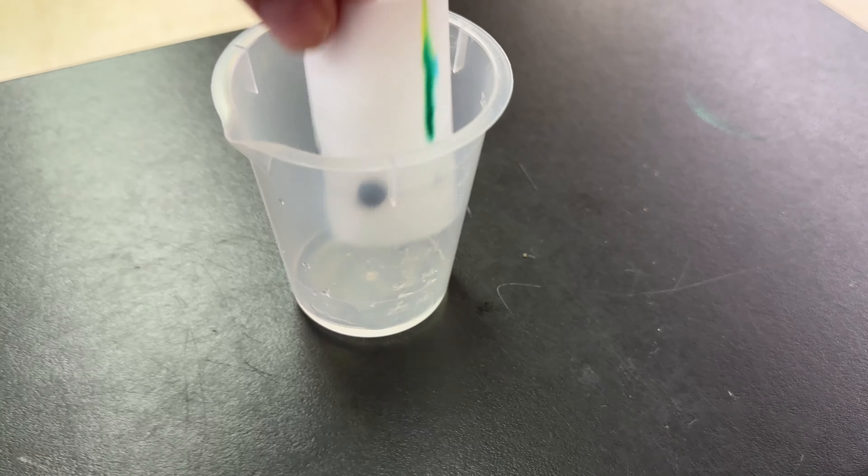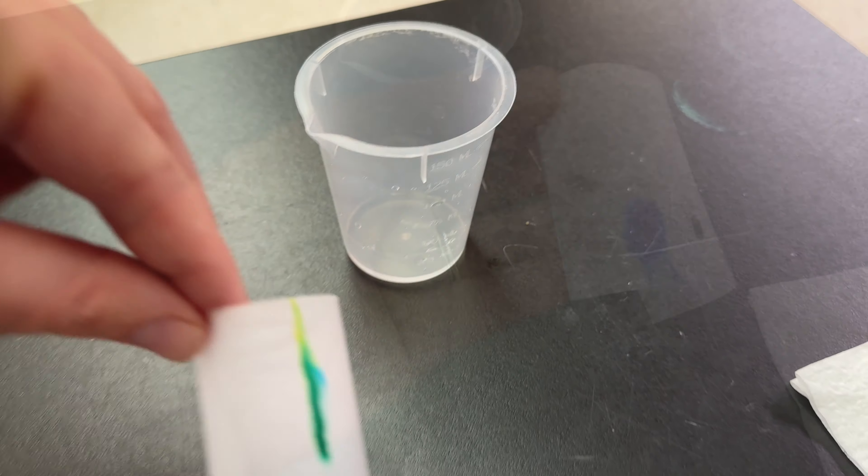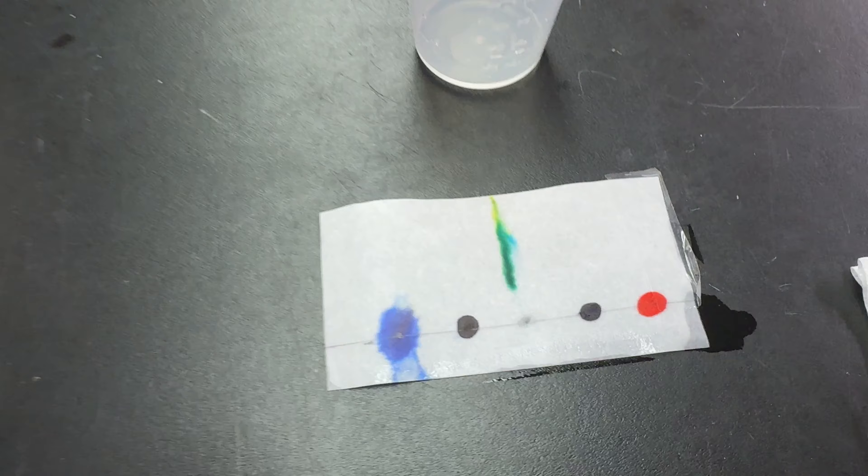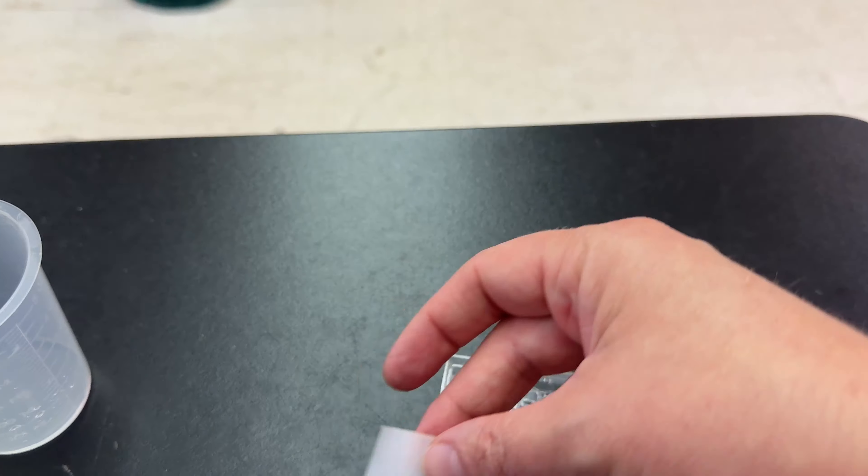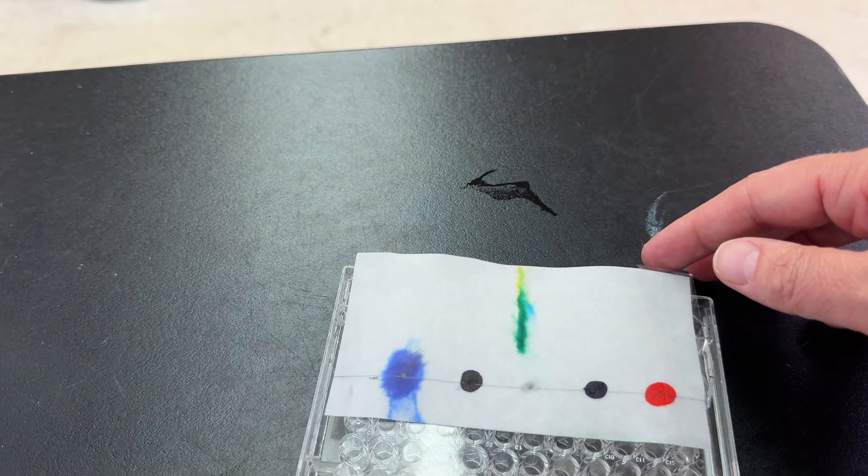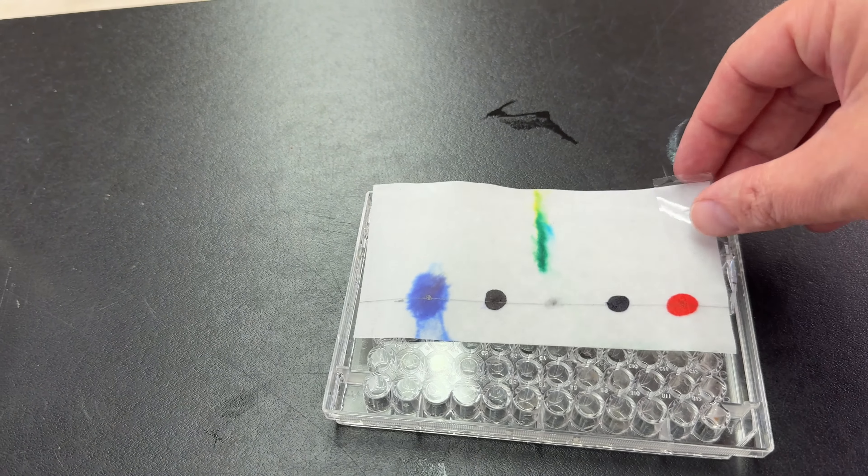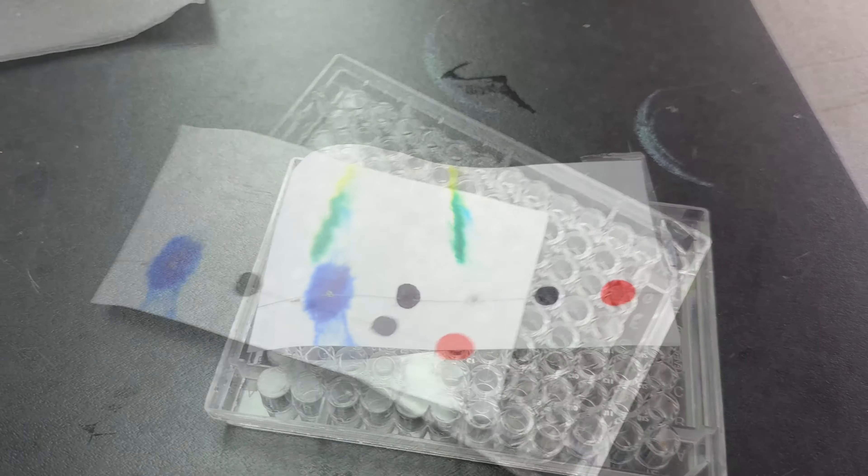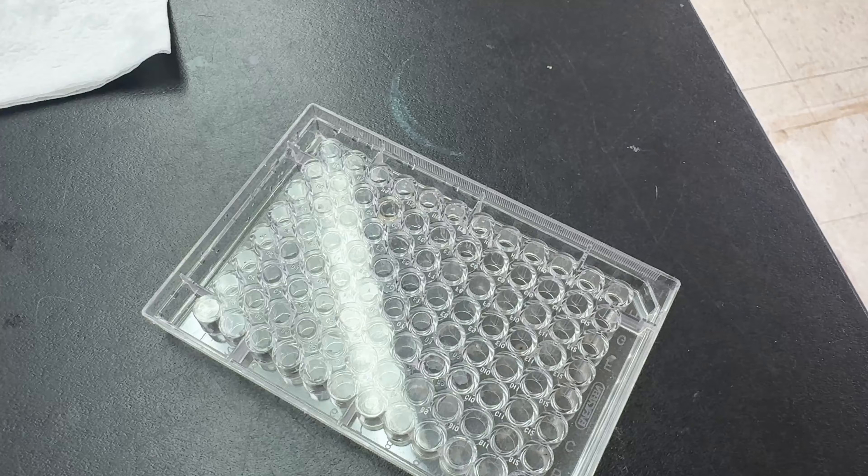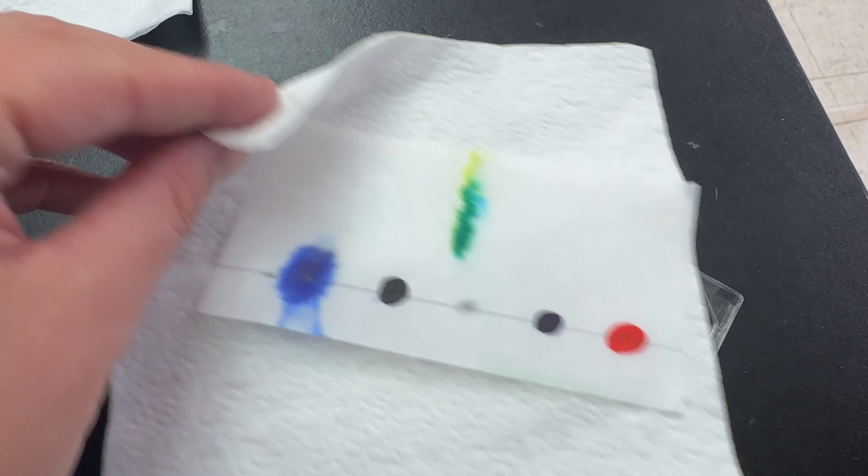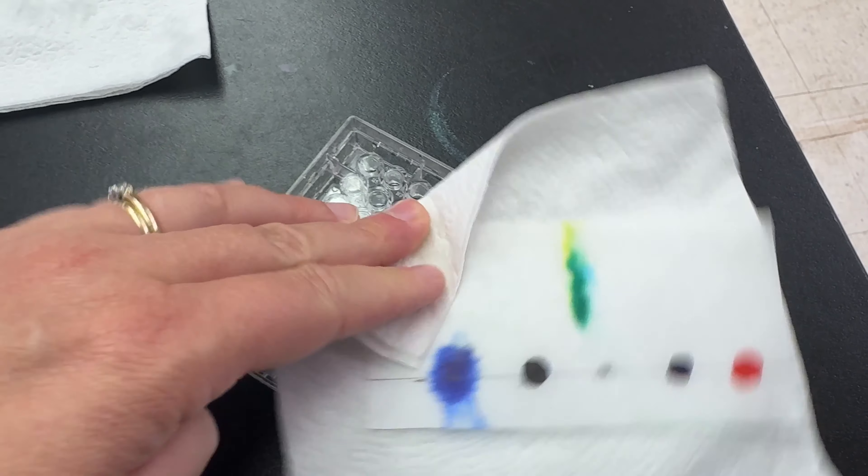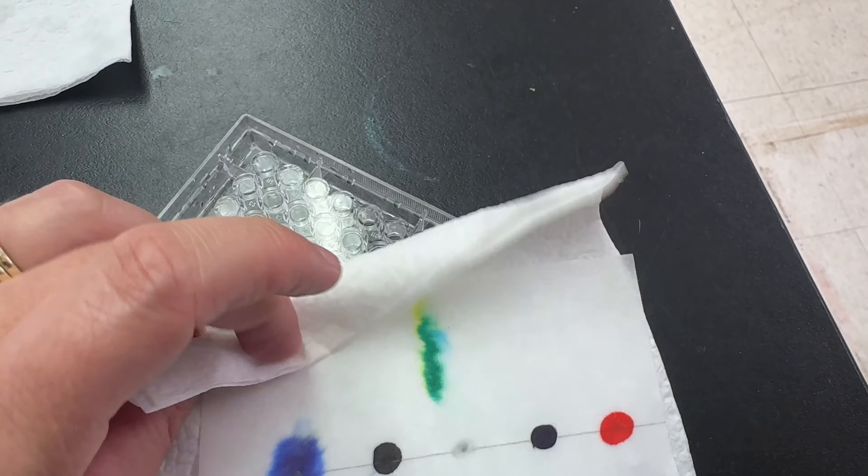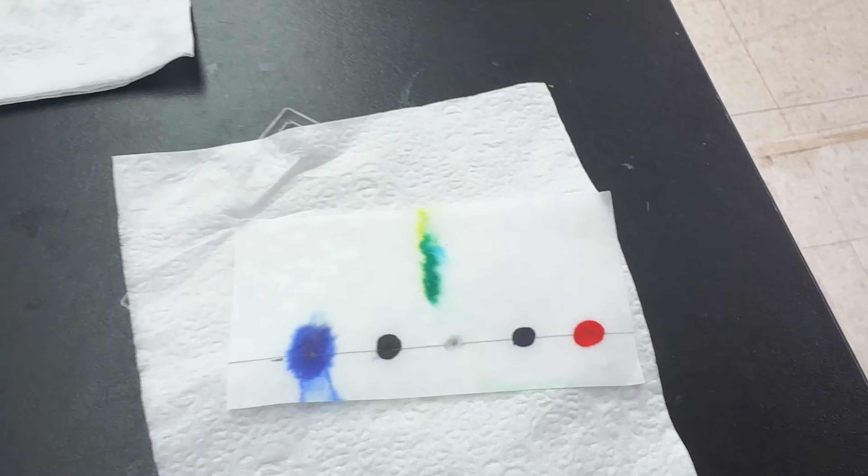Step seven: remove the paper from the beaker when the water has diffused to about five millimeters from the top edge. This may take about 30 minutes, but mine did not take that long. Carefully remove the staples or the tape and lay the paper out to dry on the reaction plate. To help my paper dry a little bit faster, I laid it on a paper towel and blotted the edges. Be careful not to blot where there is color, but you can blot the edges and the top and that'll help it dry a little bit faster.